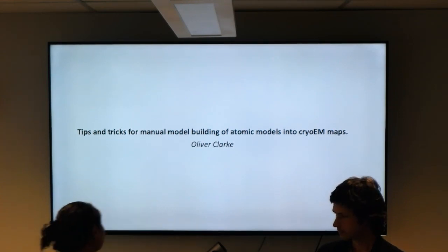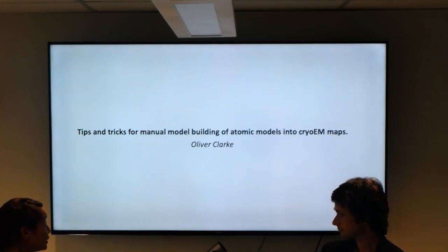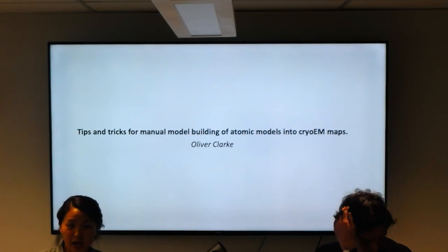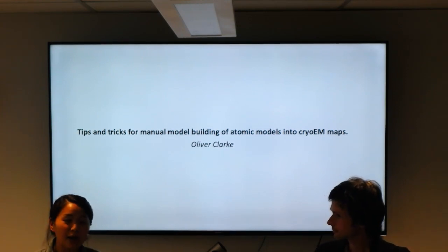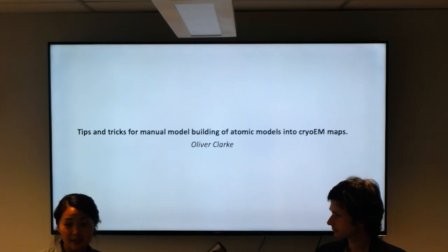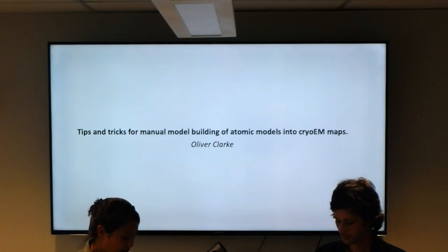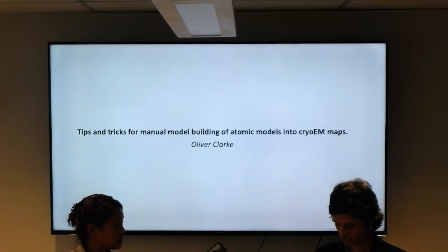Today's lecture is titled Tips and Tricks for Manual Model Building of Atomic Models into Cryo-EM Maps. And basically what that means is what you do with that medium to high resolution Cryo-EM map, how you build an atomic model into that to tell a biological story of what your research is trying to elucidate. So without further ado, I'm going to hand the stage over to Ollie.